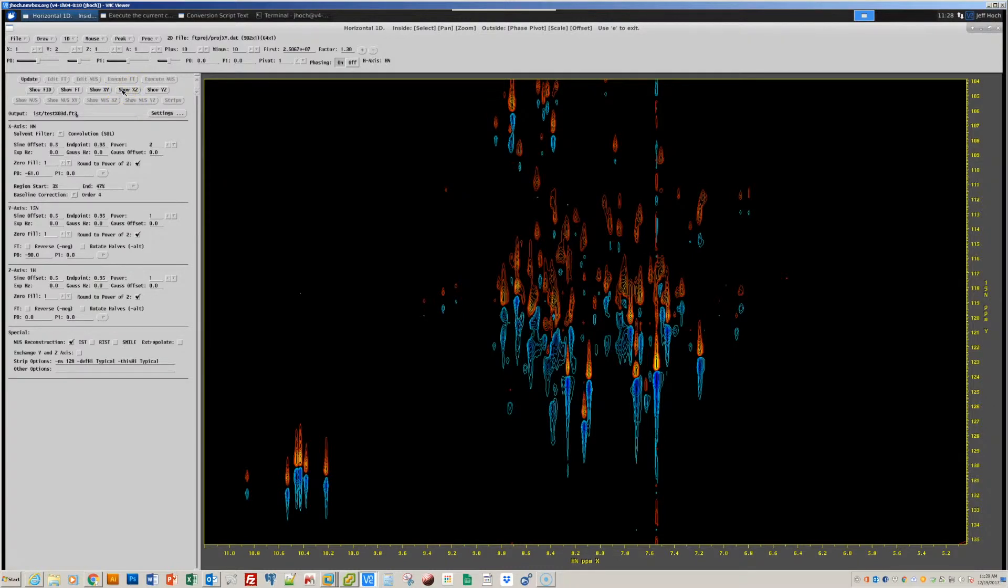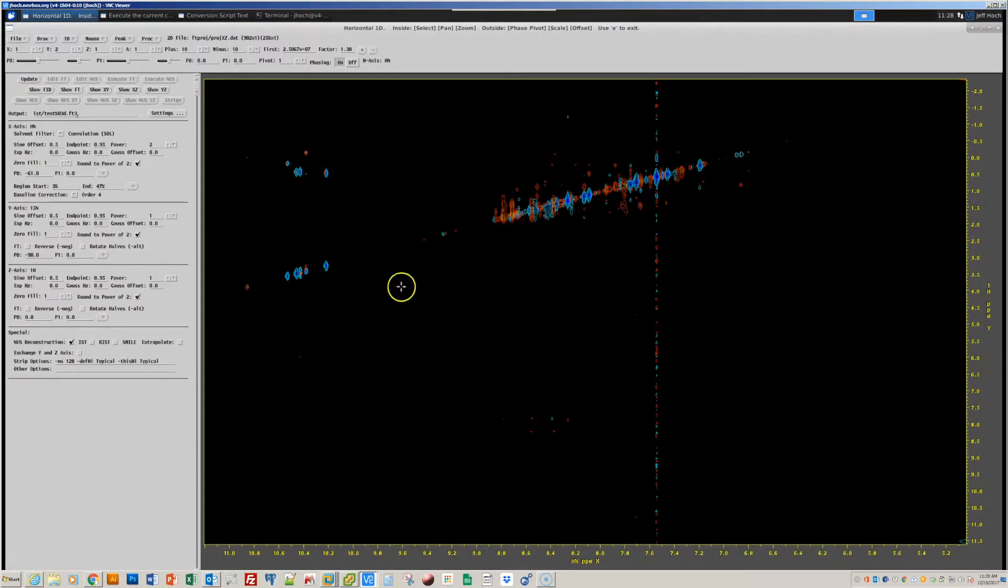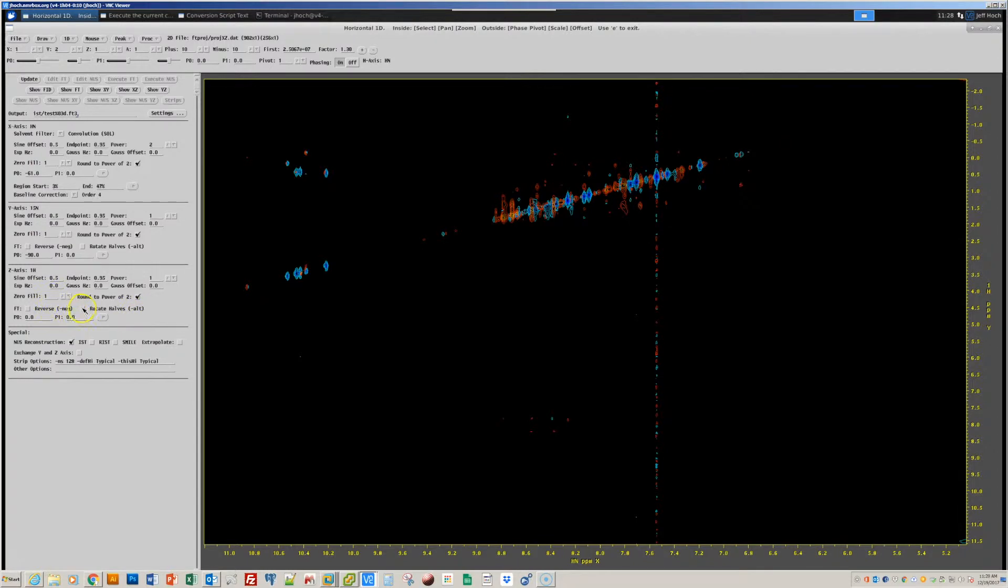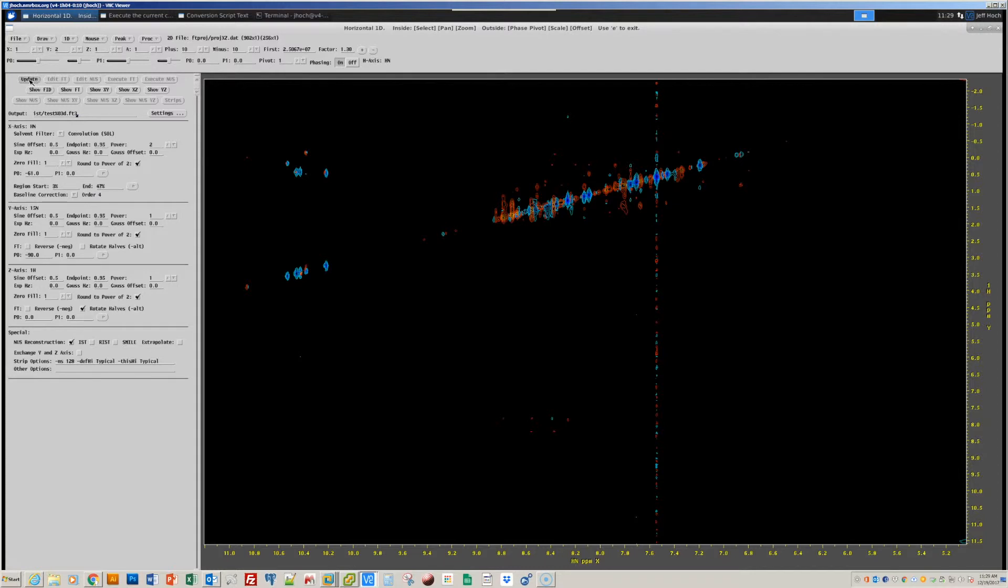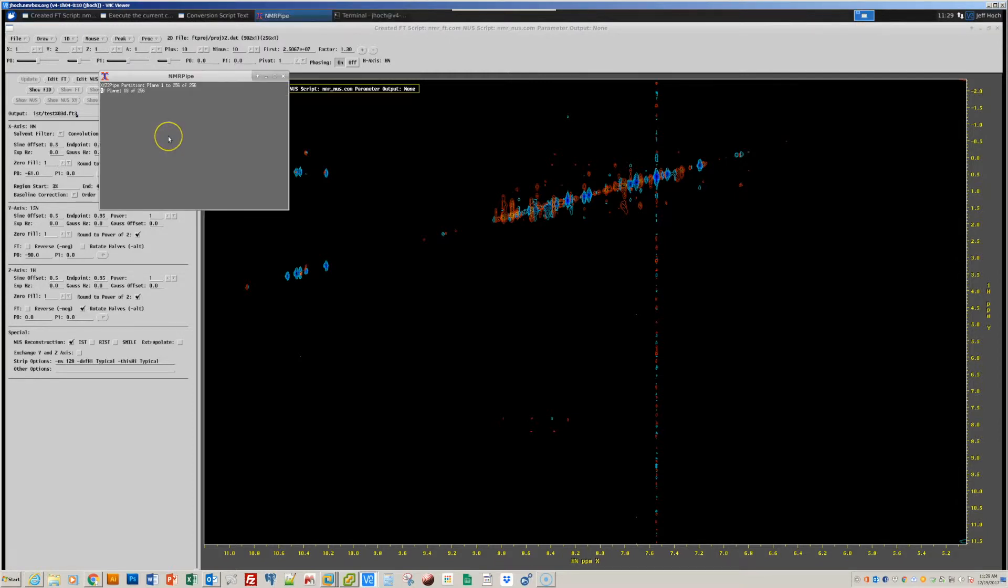And when I look at the XZ projection, I see that for this NOE dimension, the 1H dimension, that the first and second halves of the data are exchanged. When that happens, we need the special Fourier transform option that alternates the sign of every other point before FT, which will have the effect of rotating these two halves of the data. That's this checkbox here in the interface. So, I've adjusted the phase correction and Fourier transform options. I'll press the Update button to generate a new processing script, and press the Execute FT button in order to perform the regular FT on this data.